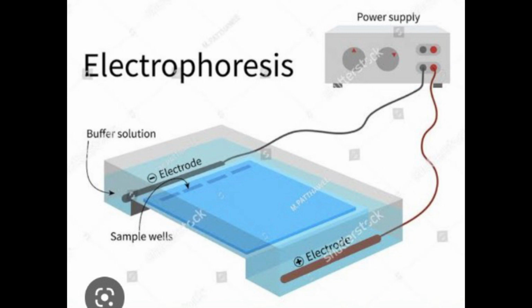Application of electric field: the electrophoresis chamber is connected to the power pack. The power pack is switched on and the current is adjusted so that 4 milliampere current flows through each slide. The process has to be carried out for about 90 to 120 minutes.